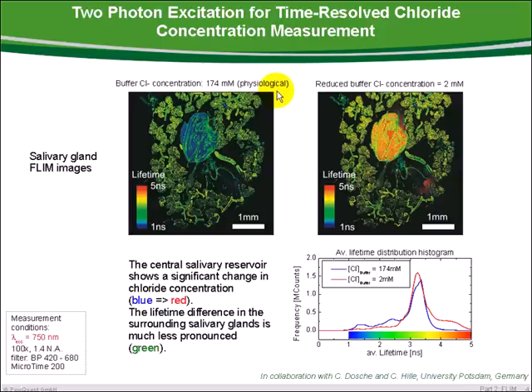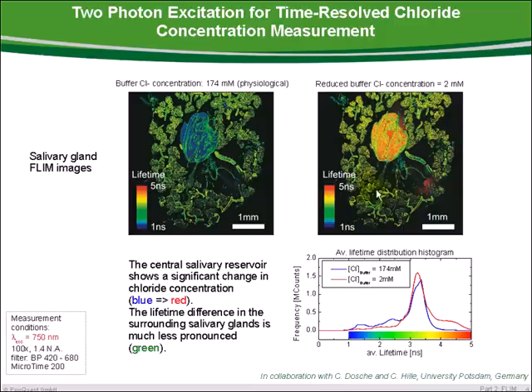At the left side, a physiological buffer chloride concentration was applied. The salivary reservoir in the center shows a relatively low fluorescence lifetime. After this measurement, the chloride concentration inside the buffer was reduced to 2 millimolar. The reduction leads to a strong change in lifetime of the salivary reservoir, indicating a chloride concentration below 50 millimolar. However, the chloride concentration in the surrounding glands stays nearly unchanged.